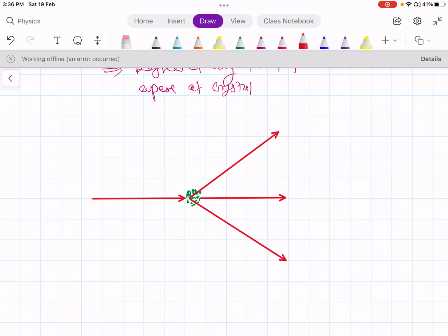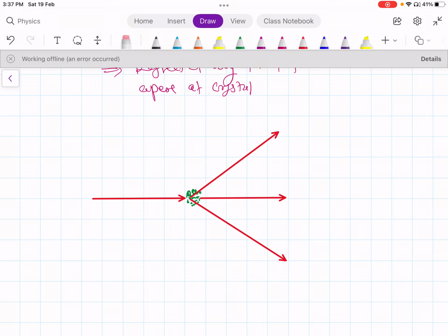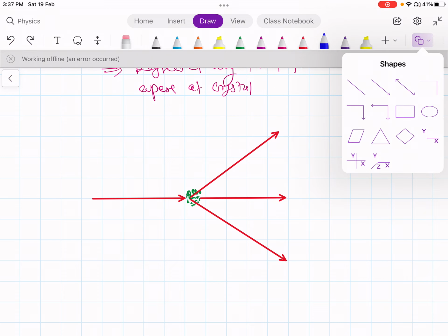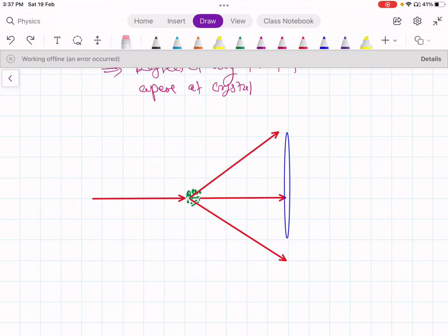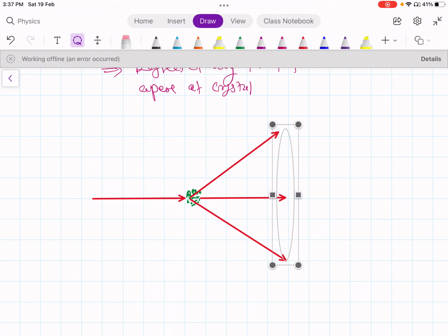So instead of getting one or two reflections, we will get reflections such that they will form a cone. So here we get a cone. One set of parallel planes will give us one cone.